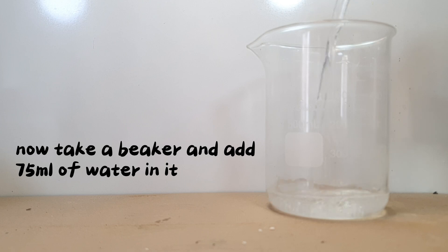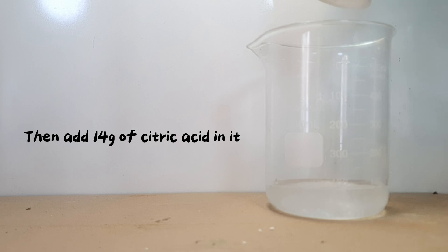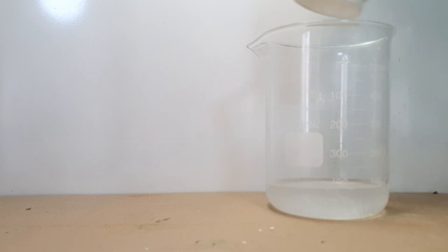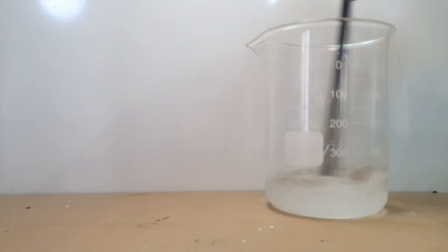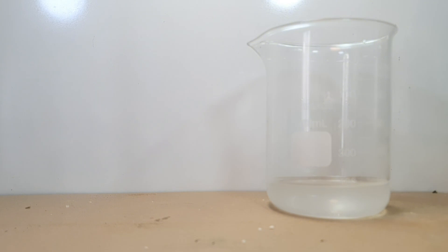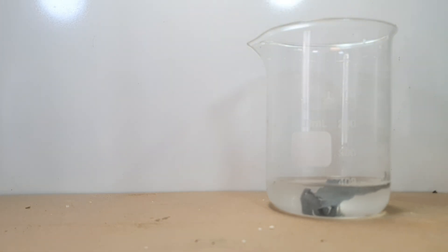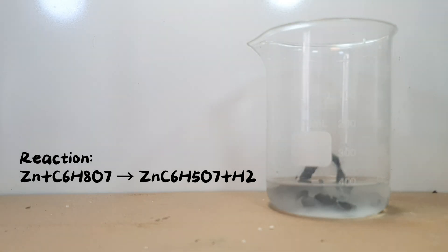Now take a beaker and add 75 ml of water in it. Then add 14 g of citric acid in it. Add 6 g of zinc metal in the beaker. In this reaction, citric acid reacts with zinc metal to produce zinc citrate and hydrogen gas.